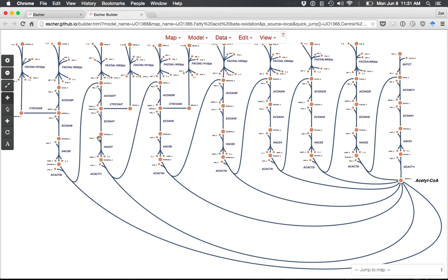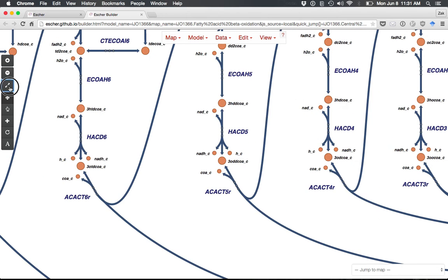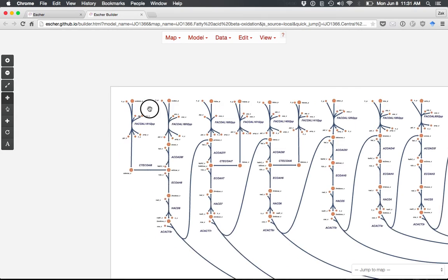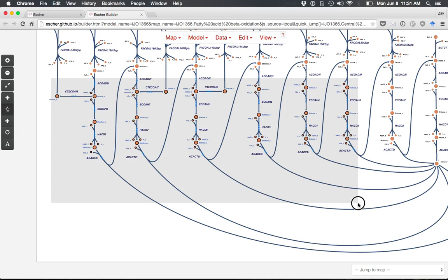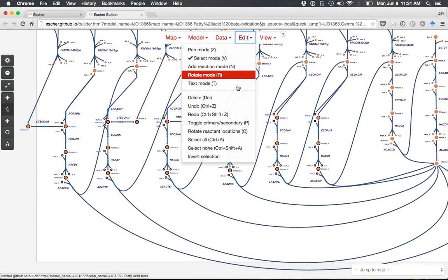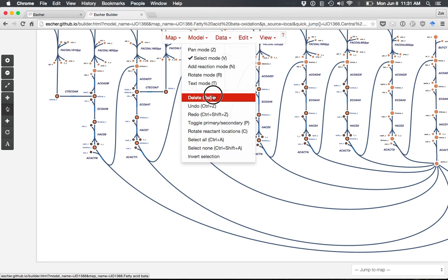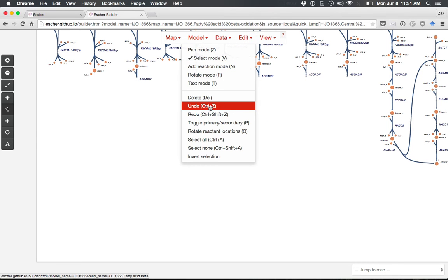The first thing you'll see is the pathway diagram. On the left, there's a button bar for quick access to commonly used features like zooming. The Pan tool allows you to move around the map. The Select tool lets you select nodes, drag them, or use Edit Undo to reverse any action, including deleting nodes.